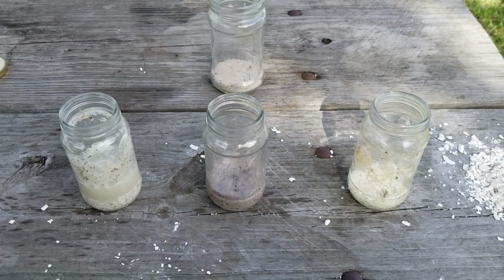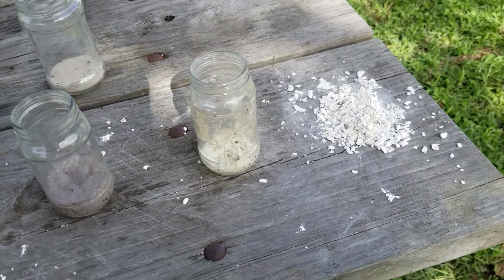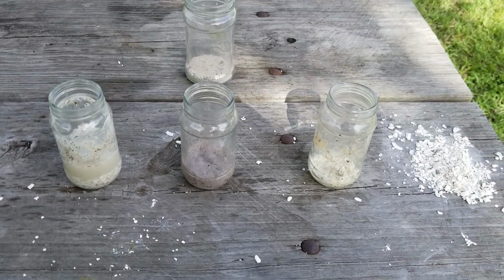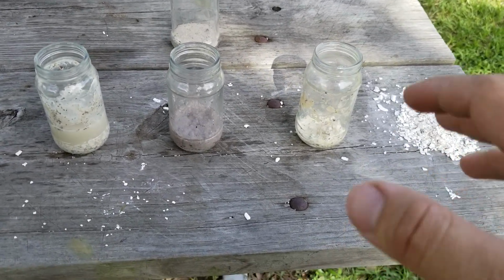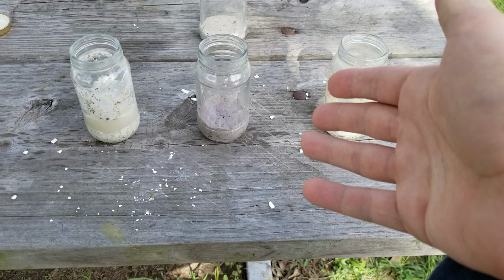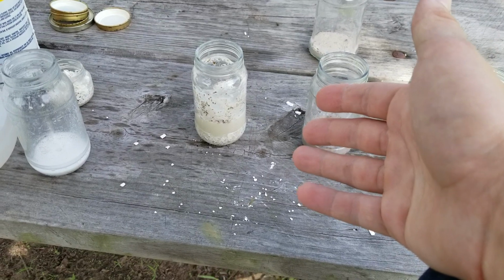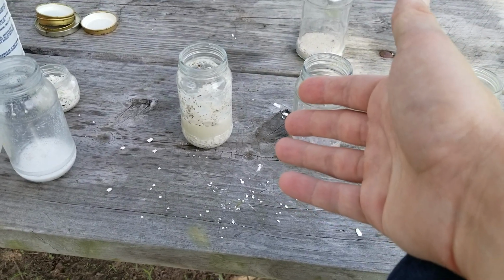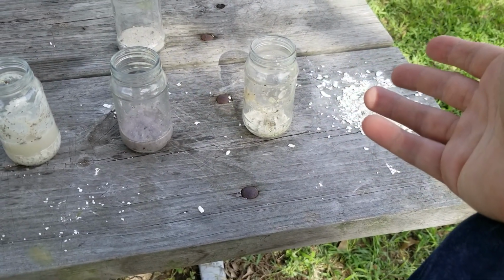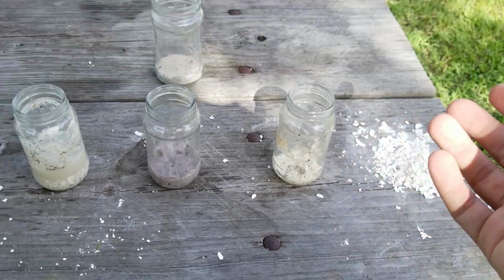So we can see that there's three different examples of acids being used to attack something, and the best one was actually hydrochloric acid, which is not the strongest acid I chose. Sulfuric acid is stronger. So there are aspects of this that need to be taken into consideration. Which one would you use for a job, etc. In the case of the sulfuric acid, I can use this as a fertilizer. Calcium sulfate will work fine as a fertilizer. In the case of vinegar, calcium acetate, maybe not so much, although a lot of bacteria don't have that bad of a time of chewing down acetate. But in calcium chloride, not much I can do with that. It works well as a drying agent if you need to dry things, but that is about it.